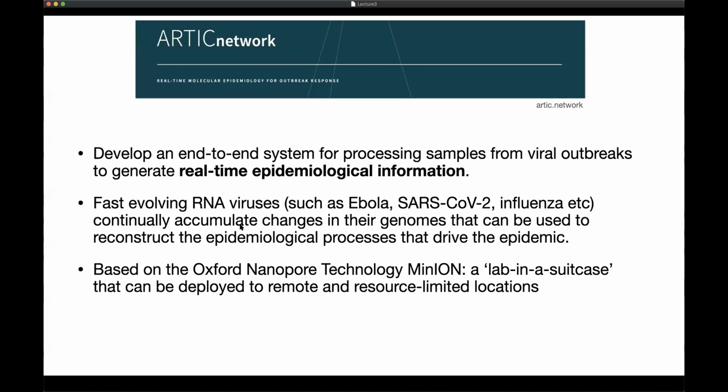And their approach was to use the Oxford Nanopore technology, specifically the MinION instrument, to develop what they called a lab in a suitcase. Their aspirational goal is to be able to go to wherever the outbreak is. SARS-CoV-2 obviously is everywhere now, so you don't have to go to the outbreak. It came to us.